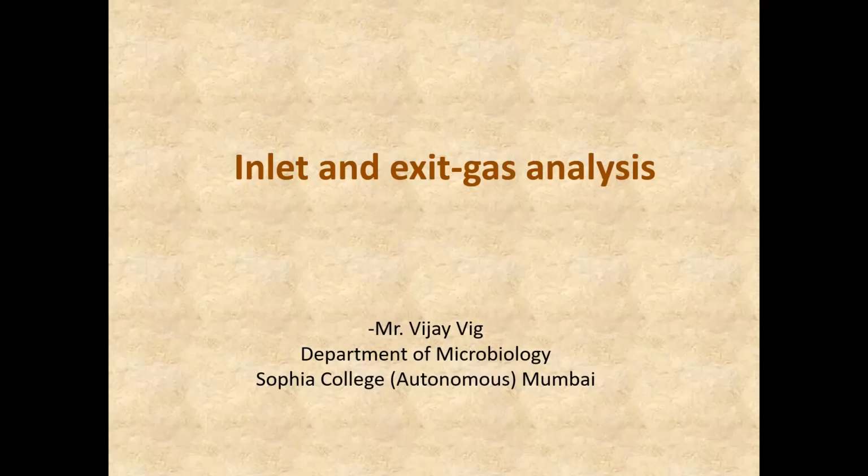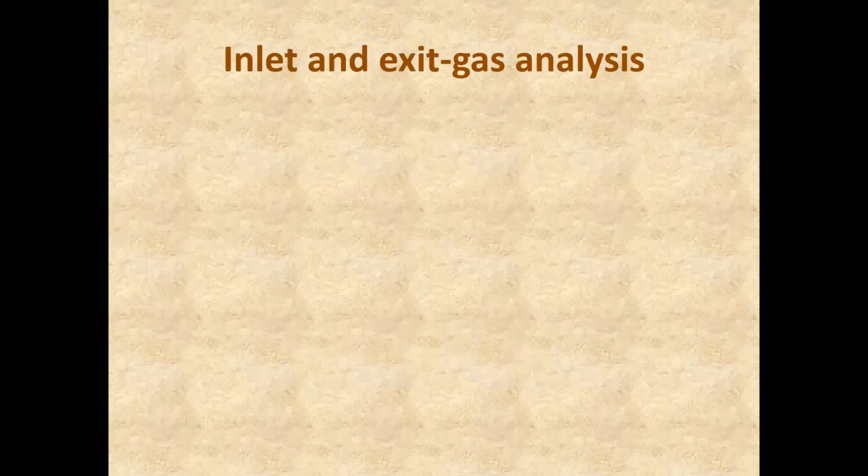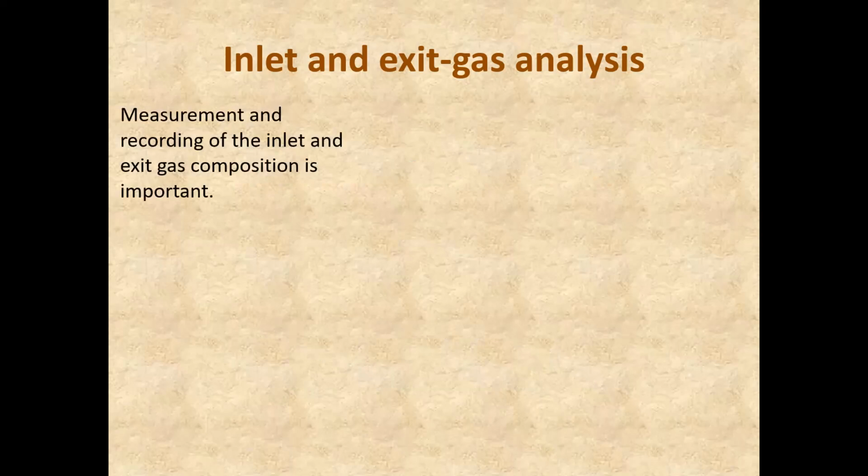Hi everyone, in this video, we will learn inlet and exit gas analysis during a fermentation. Inlet and exit gas analysis, measurement and recording of the inlet and exit gas composition is important in a fermentation.